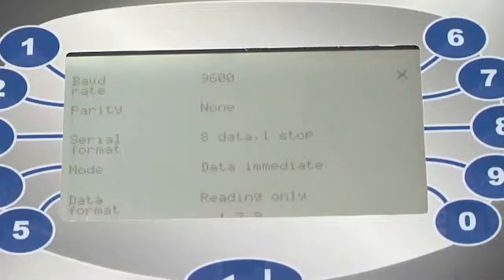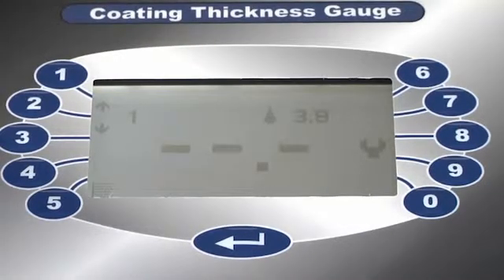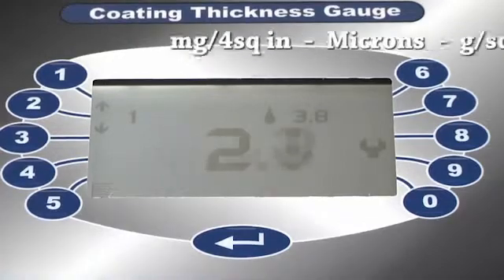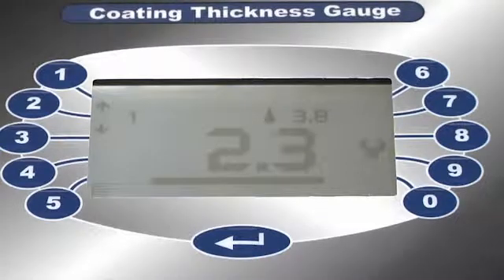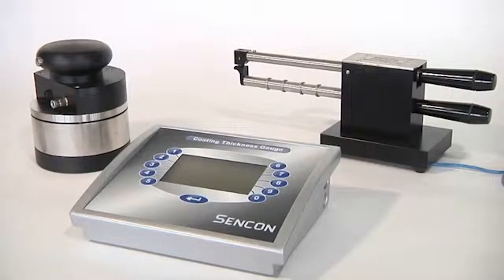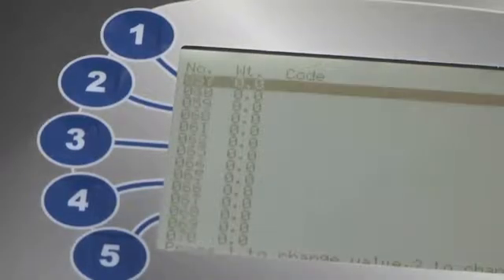The gauge will display measurements in the same format as the calibration panel, such as milligrams per four square inch, microns or grams per square metre. Up to 120 coating calibrations can be stored in the gauge.